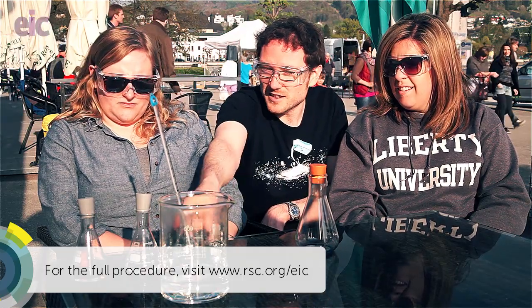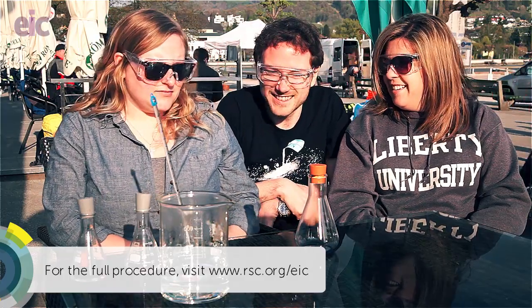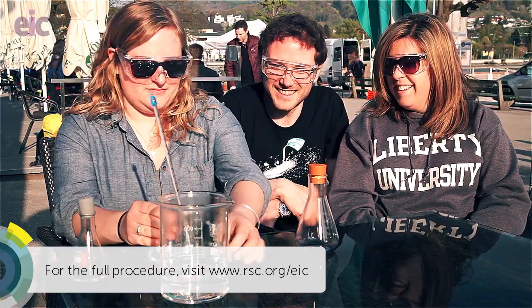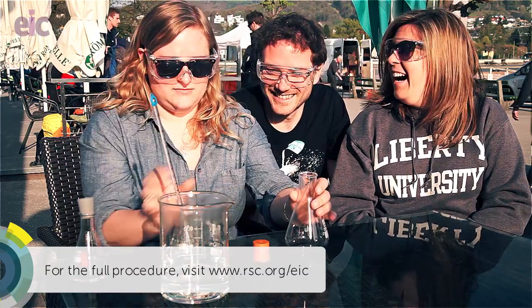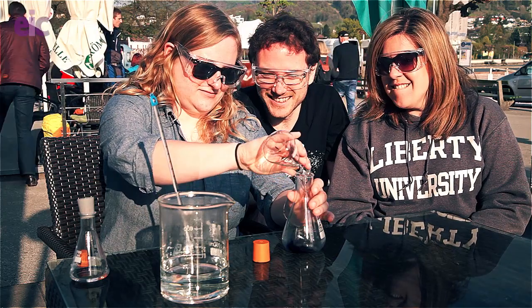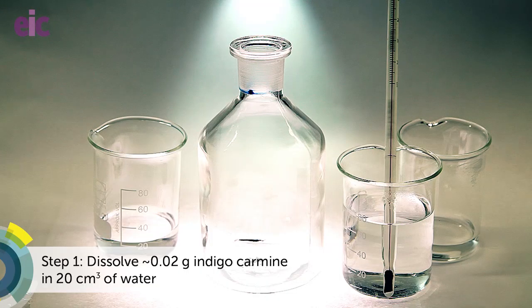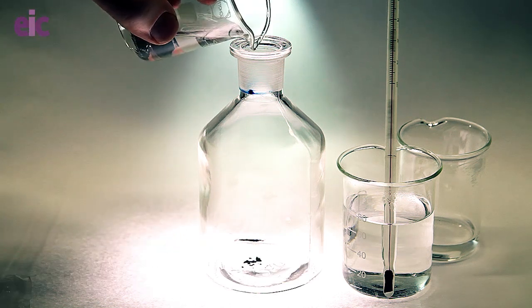Megan, we'll start off with number one. I just want you to pour flask number one into this flask here. Okay, it's blue. So what we've got in there is a dye - it's the same dye, well, a very similar dye that you used to dye jeans.